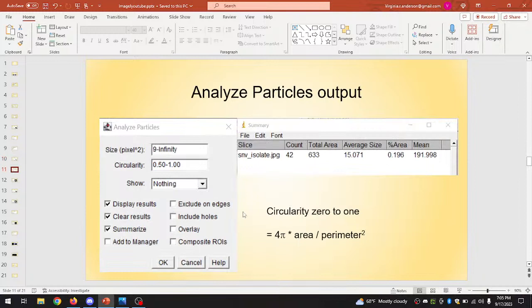And in this case, just to mention circularity, if you had almost a nothing area, you would have very little circularity. So, you know, a line wouldn't be a circle. A triangle would be closer, but a square would get even closer, and so forth and so on. And so that's a measure of what you have in shape towards circle.